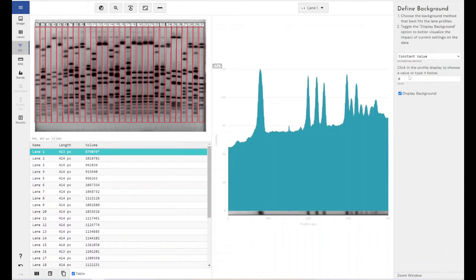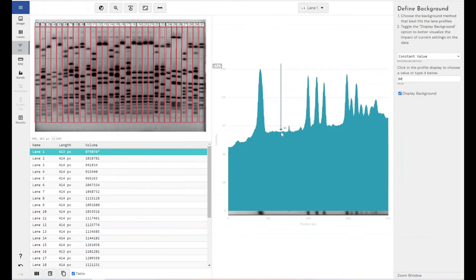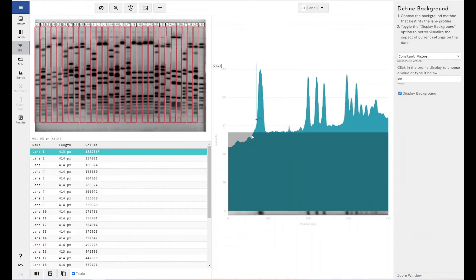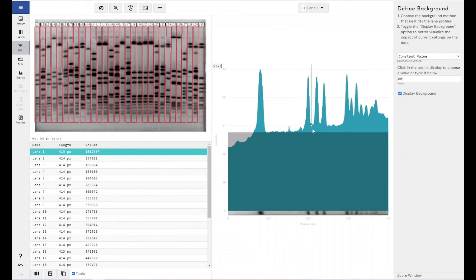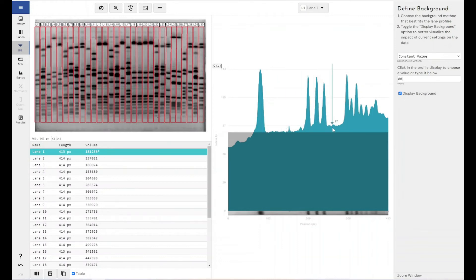We've got the ability to set the background of the lane as a constant value. So as I was saying before, if we wanted to pop it at 80 to try and focus on this area of background, we would actually lose all of this data at the top end of our lane, which might be something that we're interested in measuring.